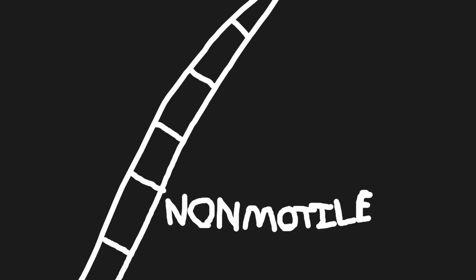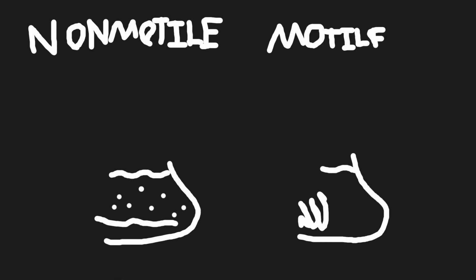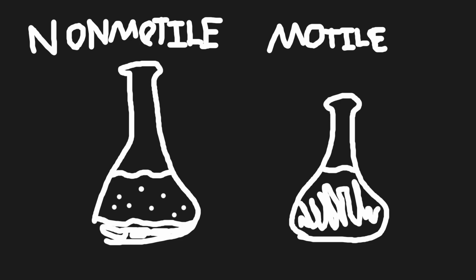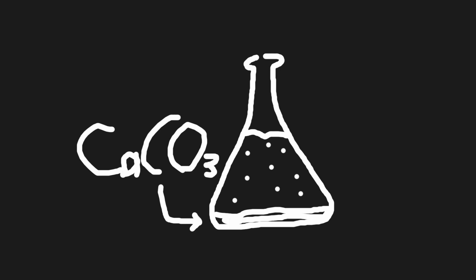There was one problem, however. The Streptomyces is non-motile, which means it can't move. Inside a liquid, this would really limit its growth and oxygen supply, as it would be stuck to the bottom. Also, the calcium carbonate I used to maintain pH must remain suspended since it is insoluble in water. I read about a device called an orbital shaker, which provides stirring as well as aeration to keep the Streptomyces oxygenated and the calcium carbonate suspended at the same time.